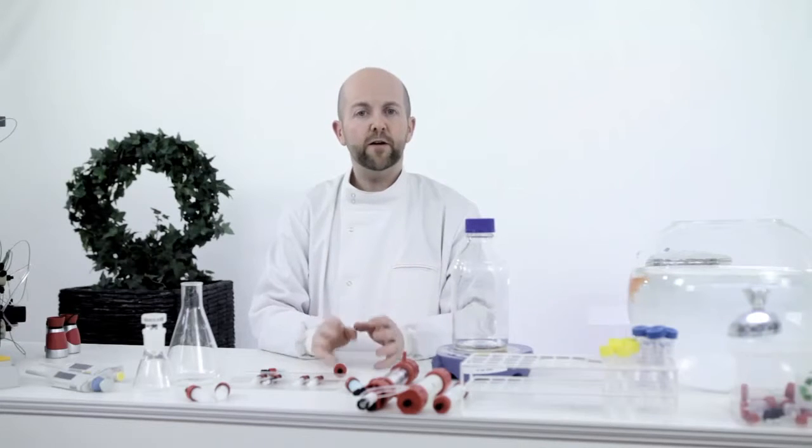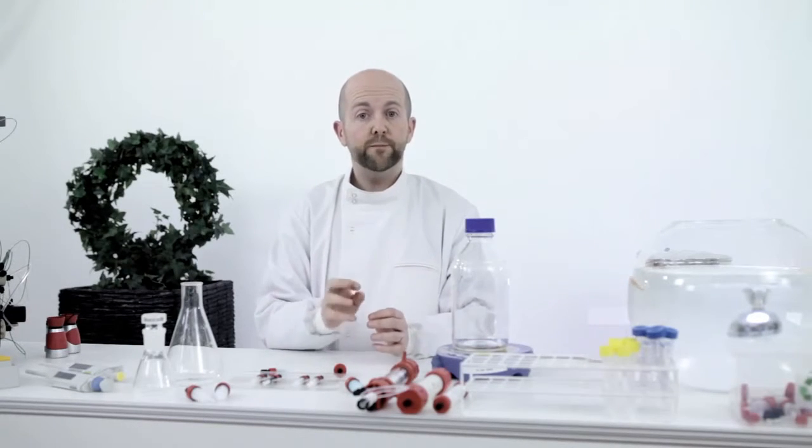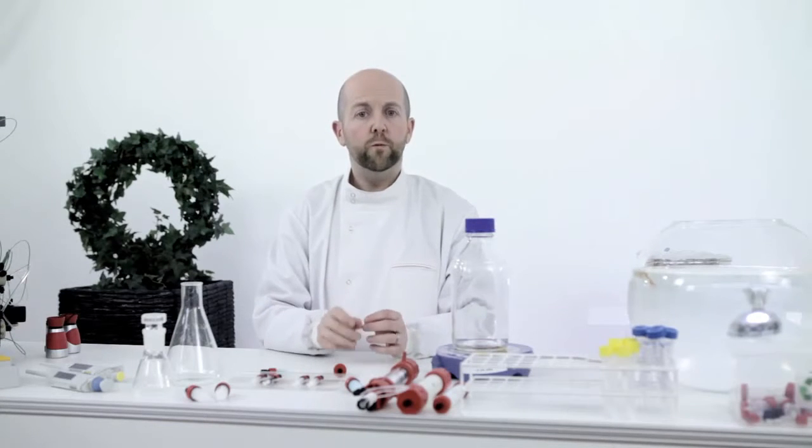Remember, never leave your column in buffers containing reducing agents, or the protein binding capacity of the column will be lowered. Check out the link to the list of reducing agents.